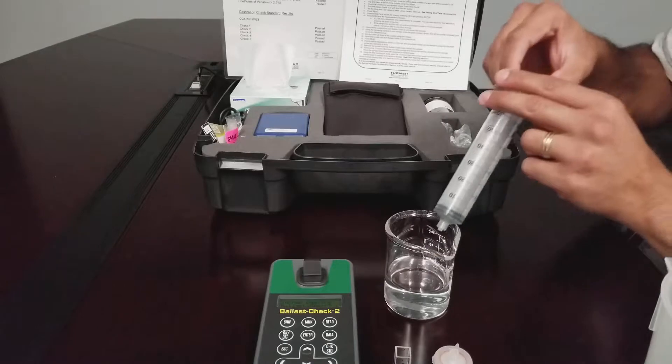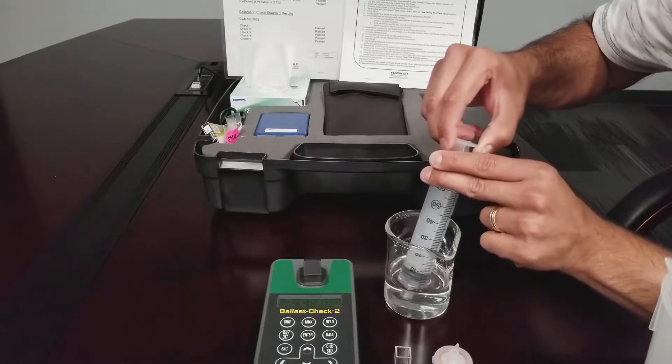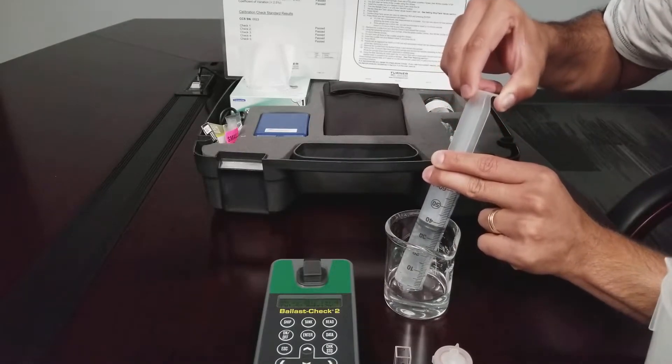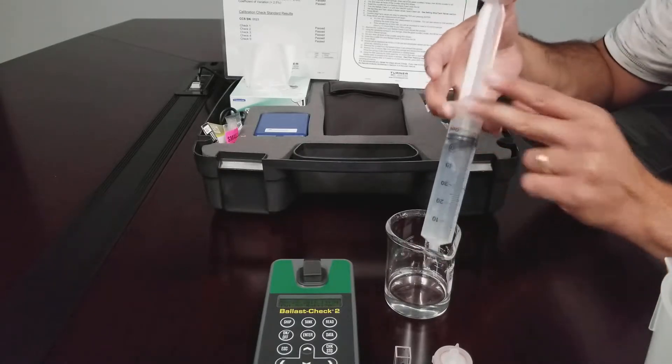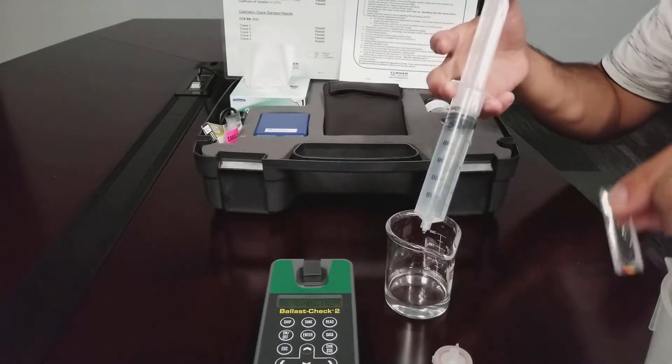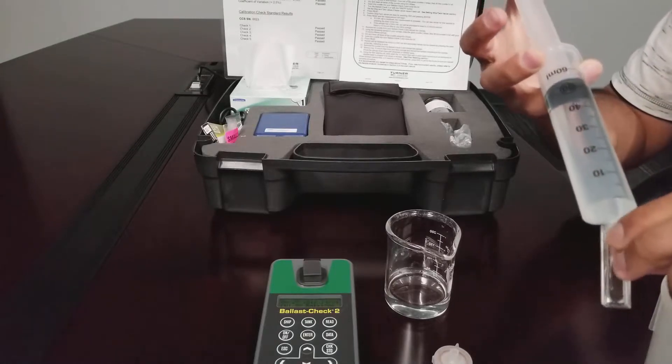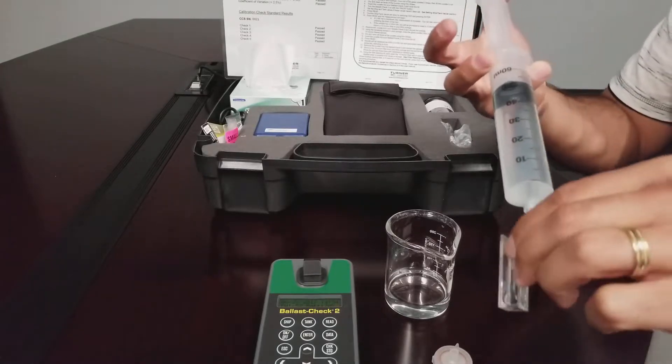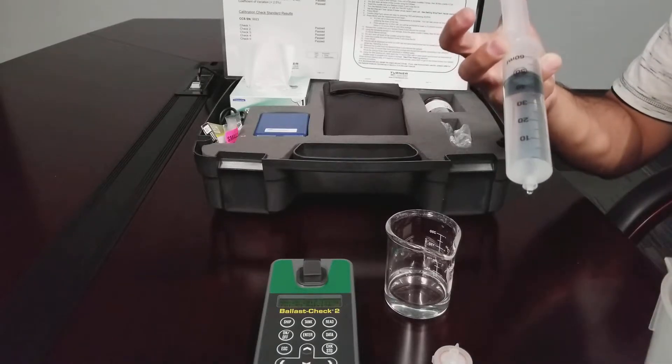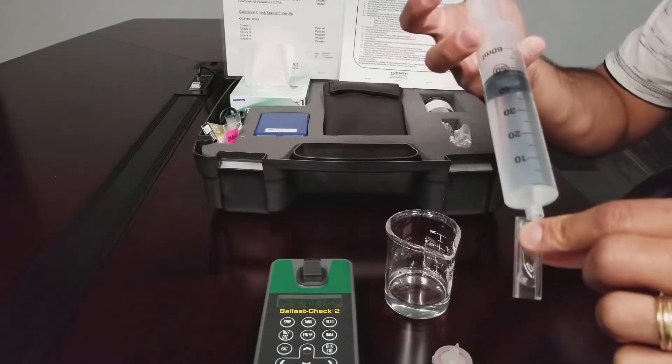Use the syringe to sample 60 cc's of ballast water. Rinse your cuvette three times with the ballast water and the syringe, and fill the cuvette three-quarters full.